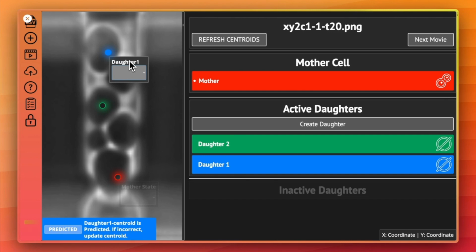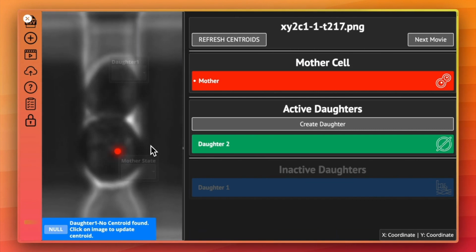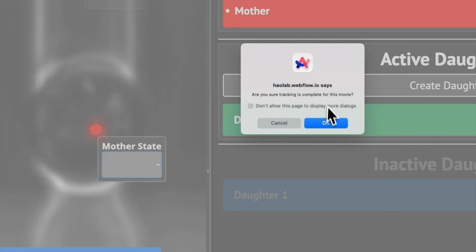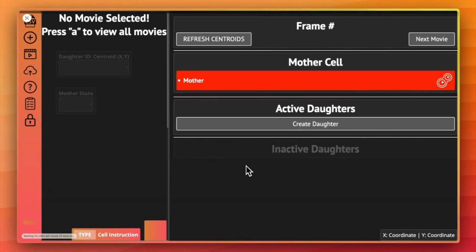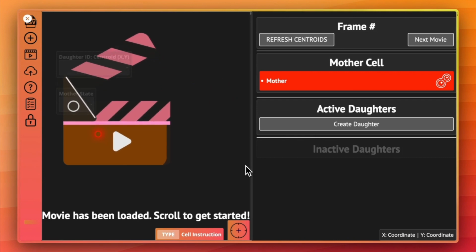Next, we will be looking at the visualization stage, which will start when you label a mother cell as dead. So like let's go down here. So once the mother cell dies, which is around this step right here, then we will receive an email letting us know that we have begun doing the morphology. And then we can see the morphology results in the final step.